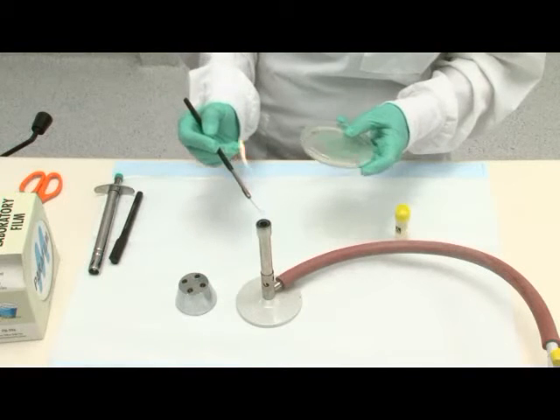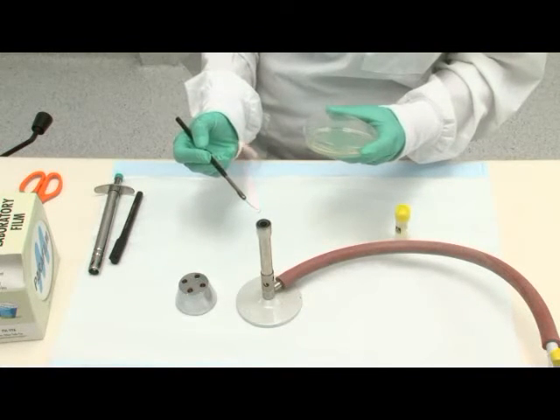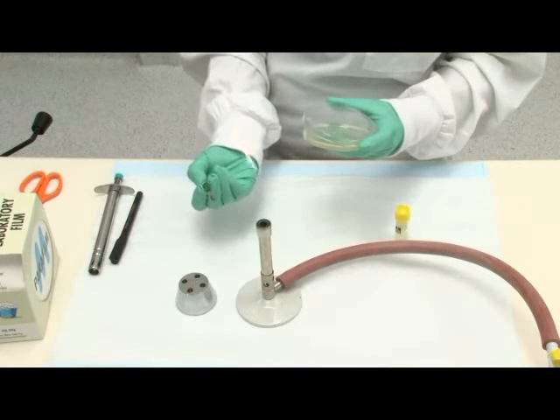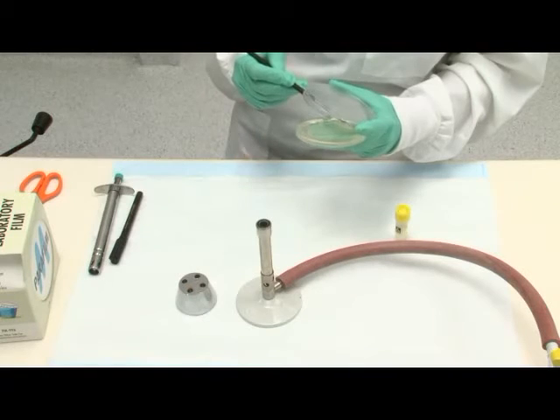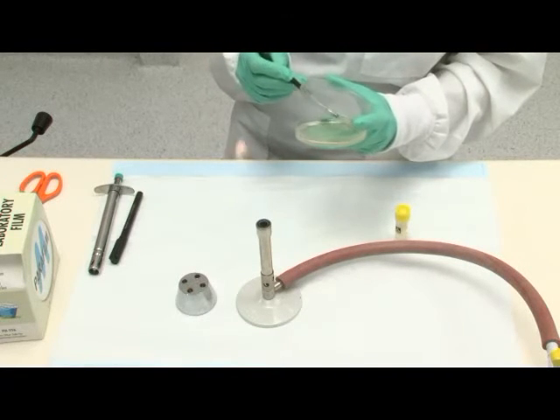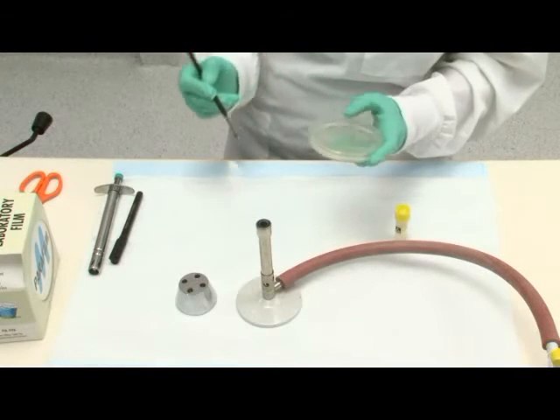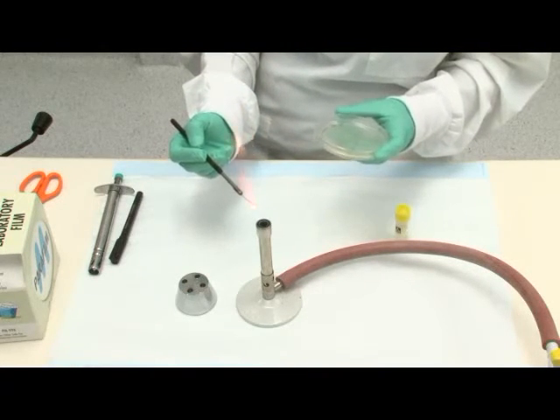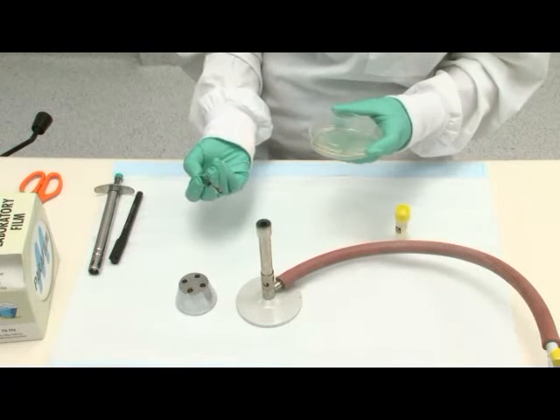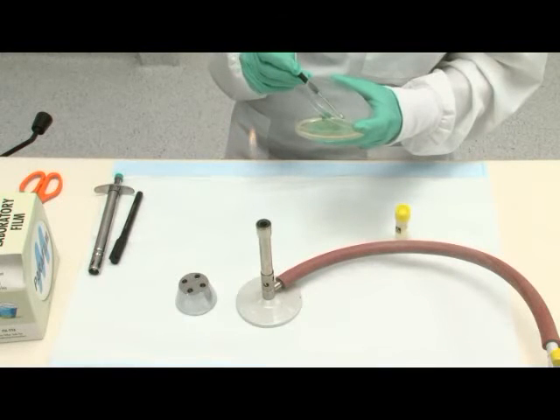Flame and cool your loop. Streak the fourth quadrant by drawing 4 streaks through the third. And make one final streak into the center. Make sure it does not touch your original inoculation.